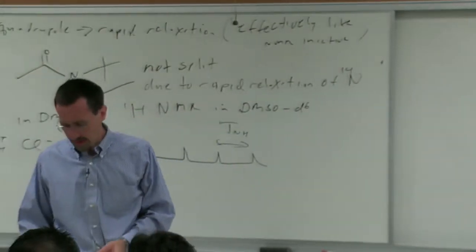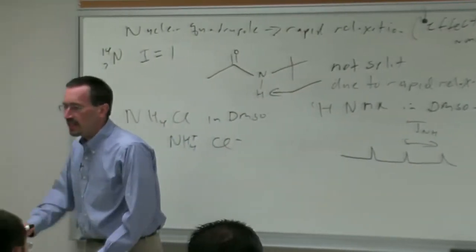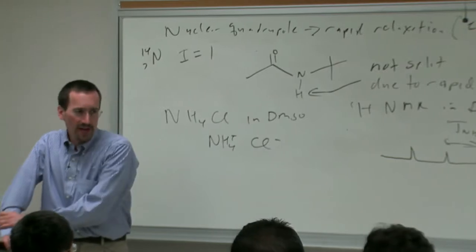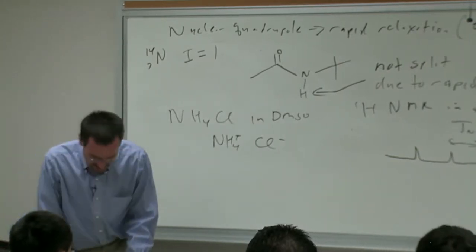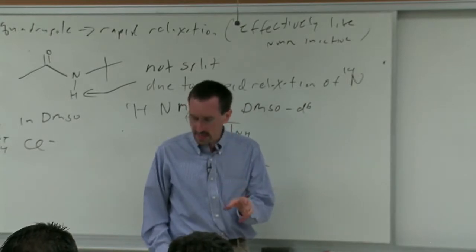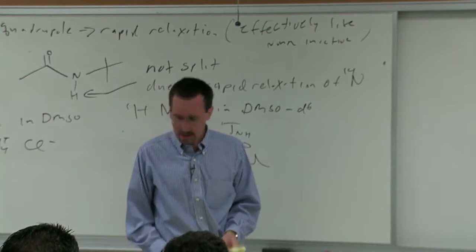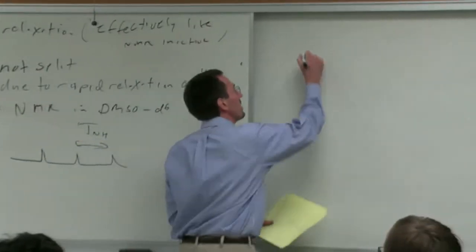in structure determination. All right, so when we last left our spinning nuclear dipole, he was spinning in the presence of an applied magnetic field. And I said there were two states, the alpha state and the beta state. And the alpha state was lower in energy than the beta state.